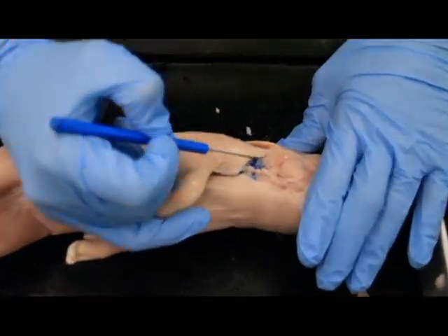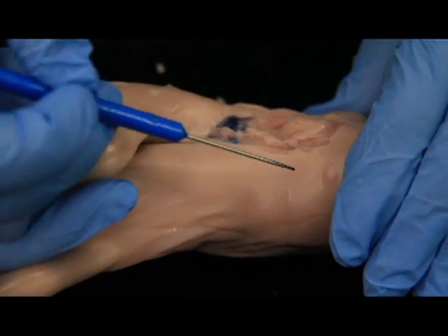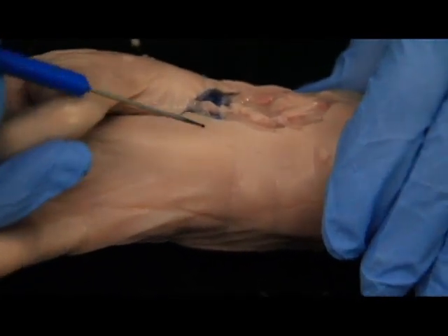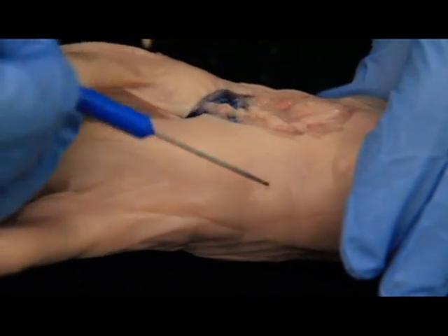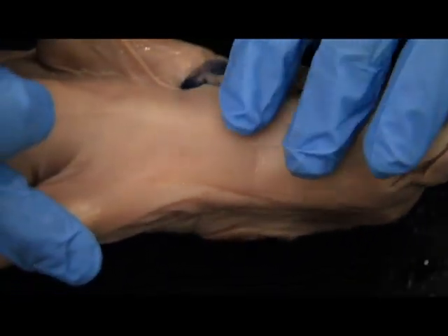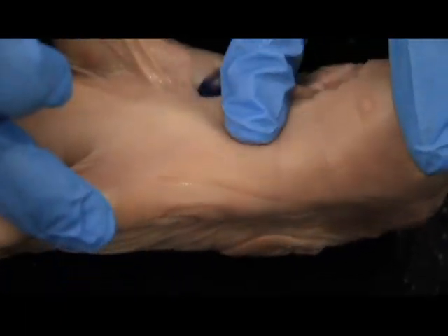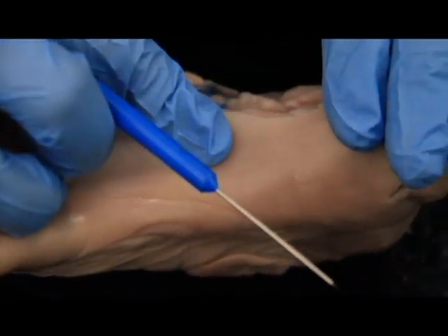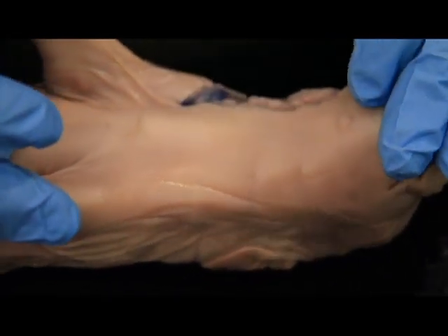And since we've already opened up this area here, we're just going to start working our way over here. And again, there's all this neck tissue, this fatty material here. This is not really important, so we're going to be able to cut through this pretty easily. The thing I want you to look for is this little ball in the throat right here. You can't see it, but I can feel it under my finger. If you feel down the neck, you'll actually be able to feel that ball in the throat. And that's actually true of humans as well.